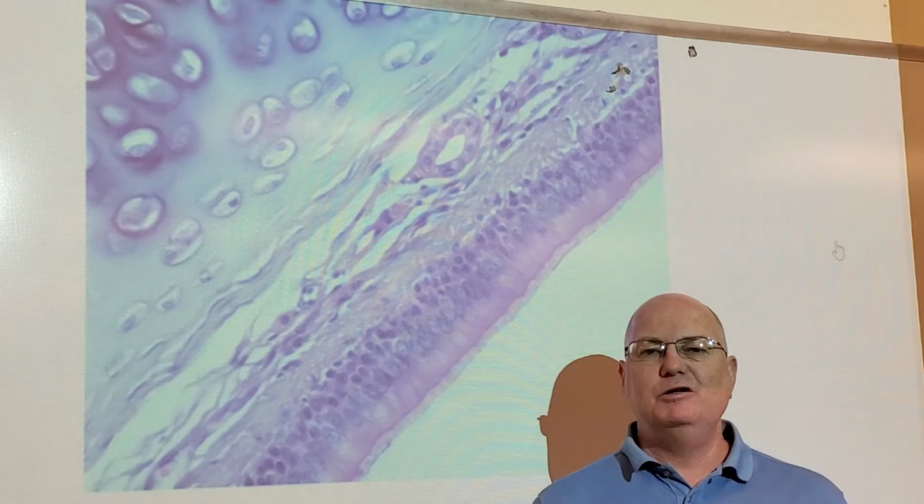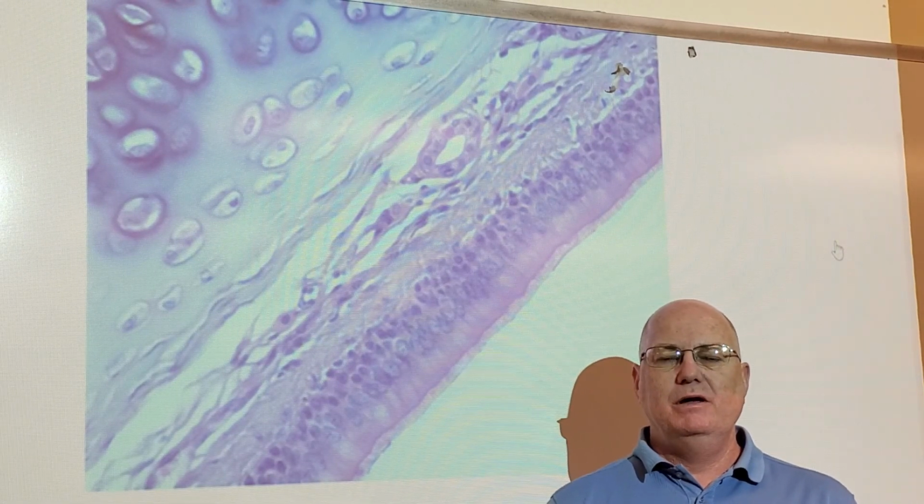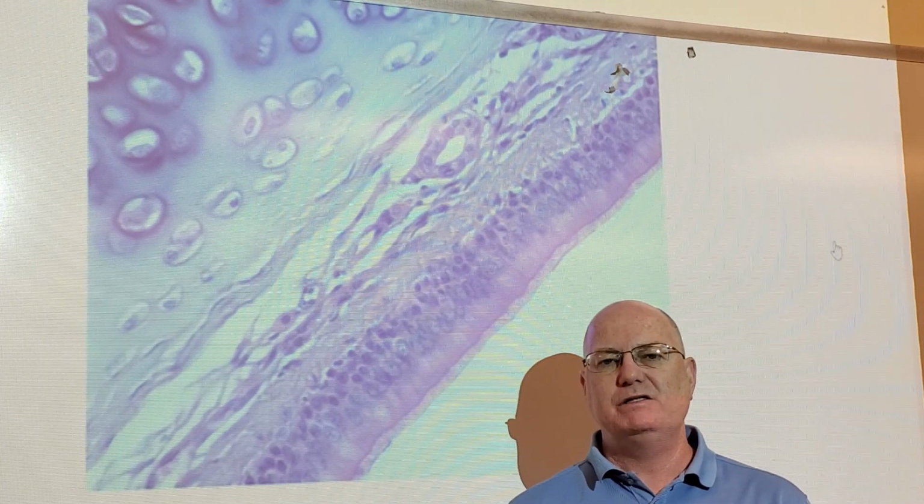Hey everyone, welcome to Professor Long's Lectures in Anatomy and Physiology. I'm Professor Bob Long. The video I'm about to do is the histology of our respiratory system. We only have a few slides to look at.